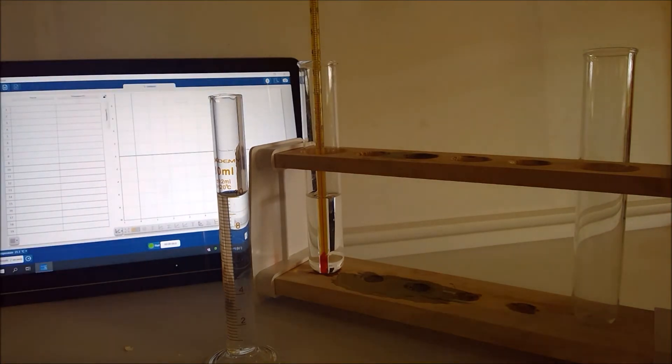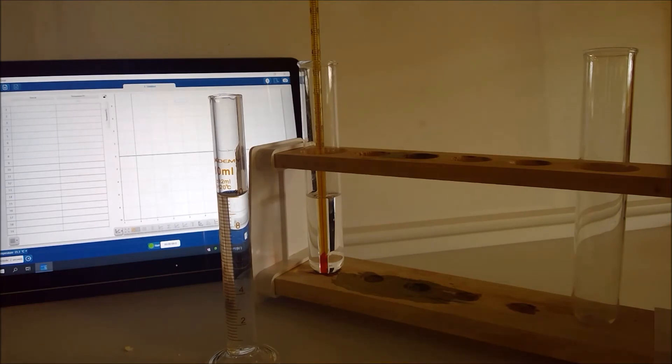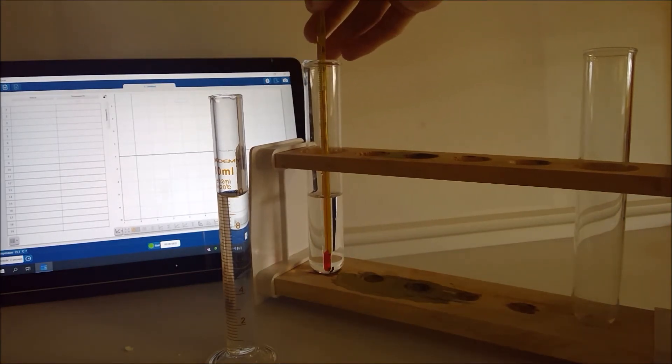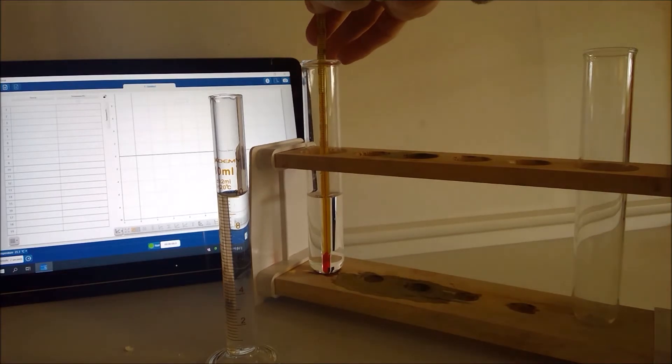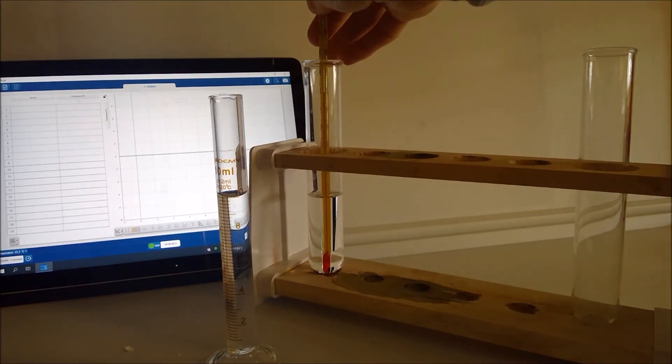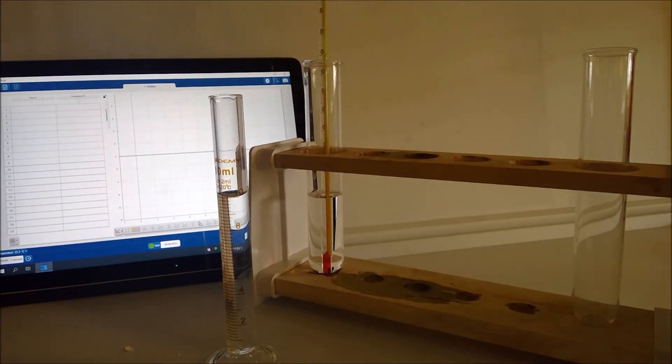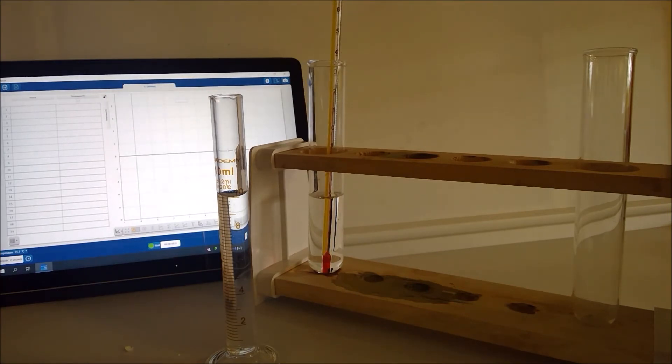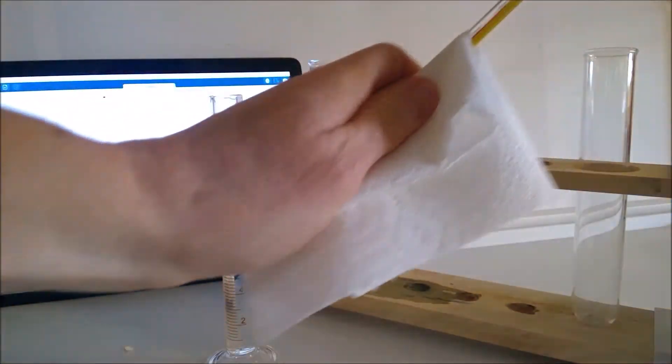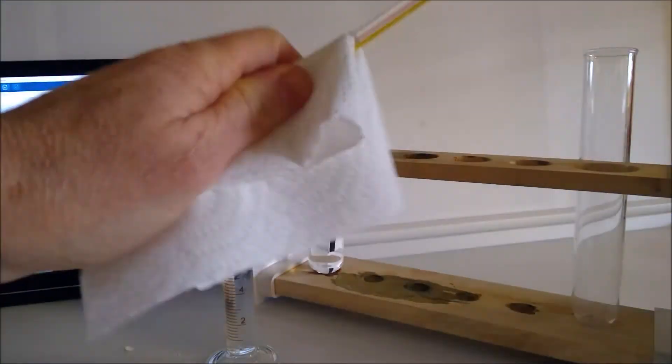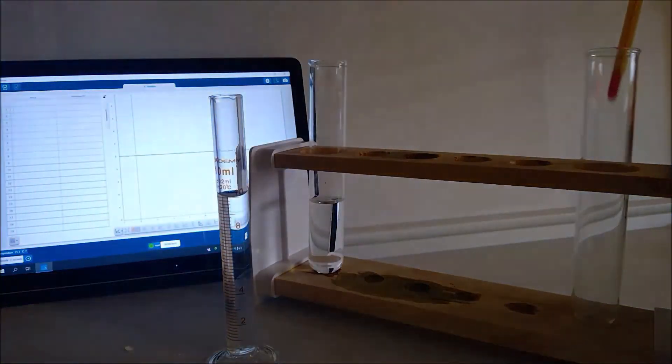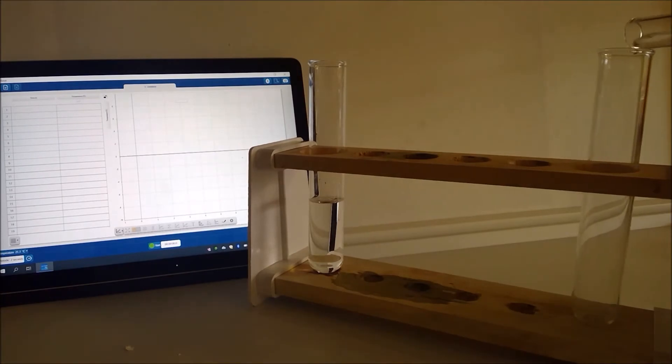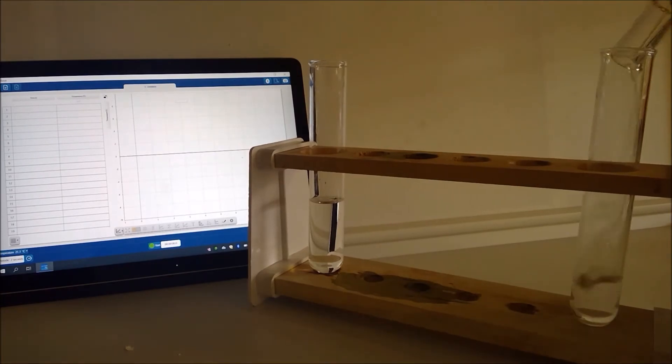Okay so we can record our initial temperature of the acid in the results table and that is reading 21.0 degrees C. And then I'll dry the thermometer there and we need to transfer our alkali into the boiling tube there.